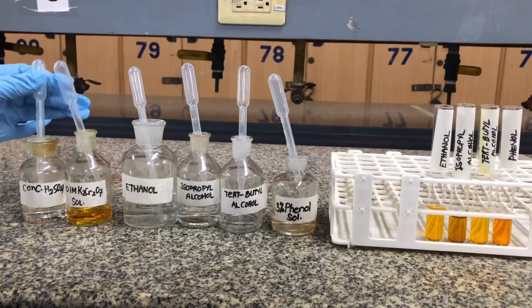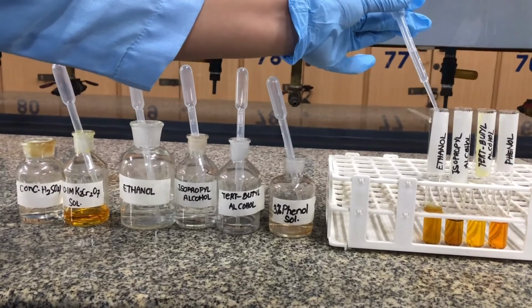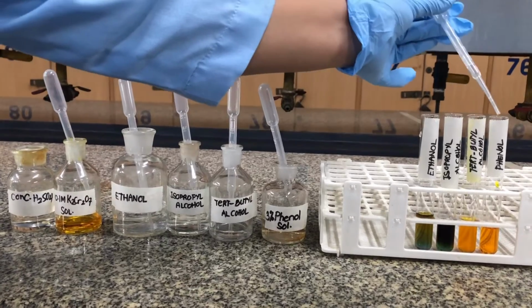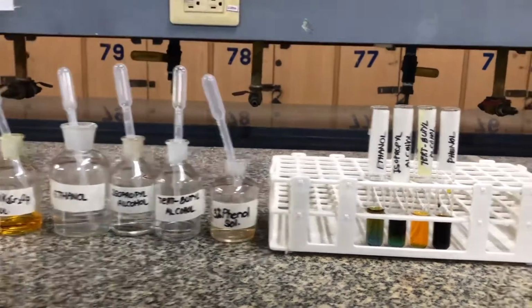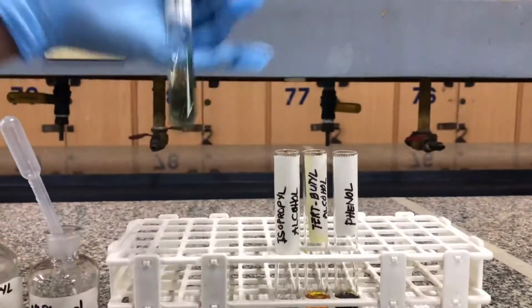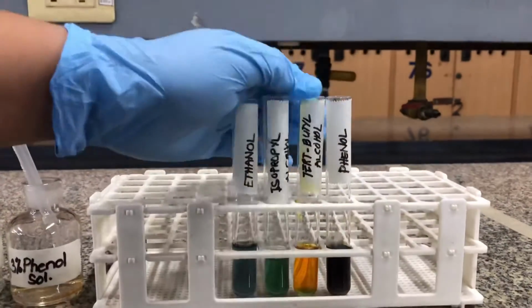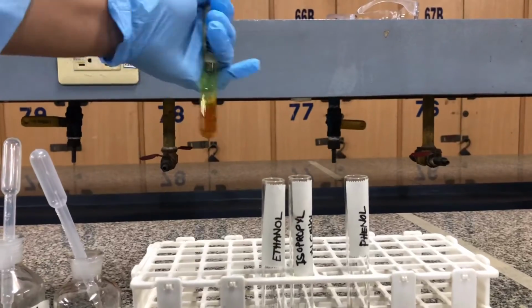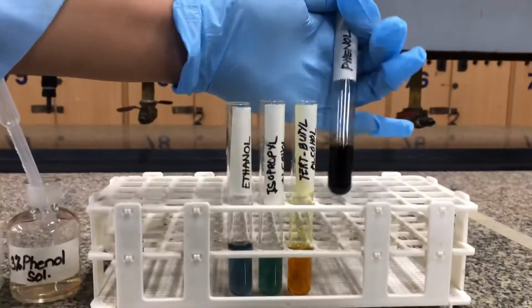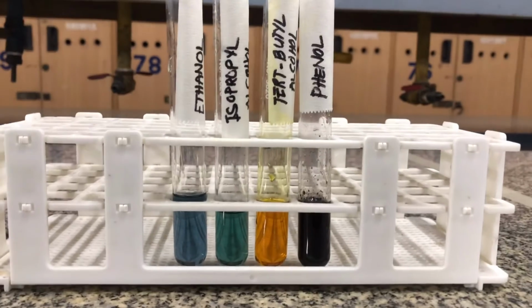After which, 5 drops of concentrated sulfuric acid were added to each test tube. The test tubes were then shaken for proper mixing. The appearance of bluish-green or green solution is a positive result. This is because the oxidizable alcohols can reduce the orange dichromate ions into green chromic ions. The result of phenol is brown due to its specific oxidation products.